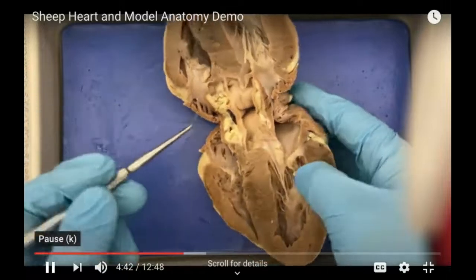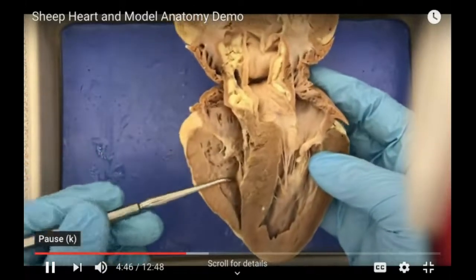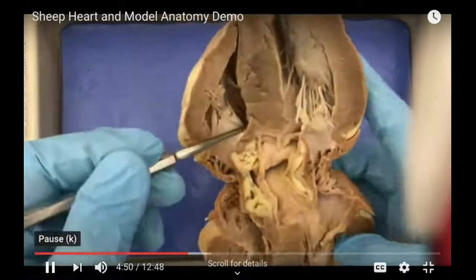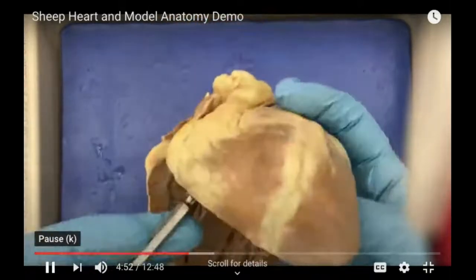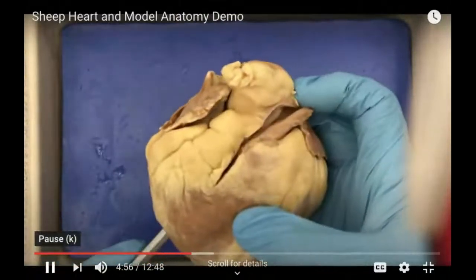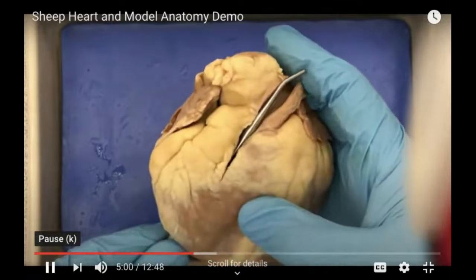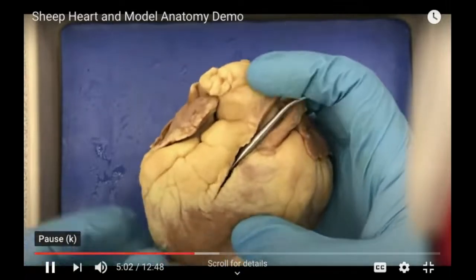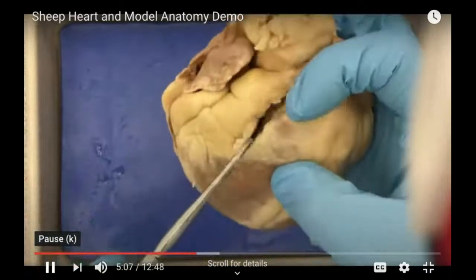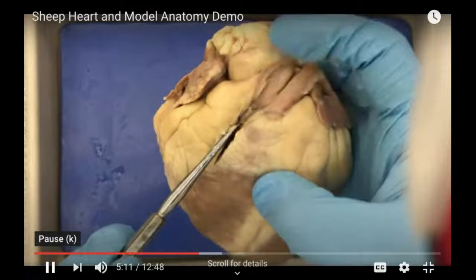So then blood will flow from here to here, and it'll go up and across. If you take the probe and stick it like this, it will come out of the pulmonary trunk. So here's the pulmonary trunk. Therefore, the probe is actually going through the pulmonary valve, which you see here. Pulmonary valve.